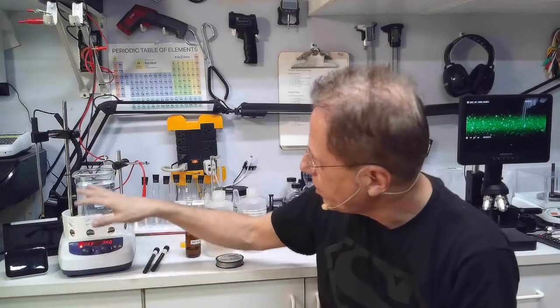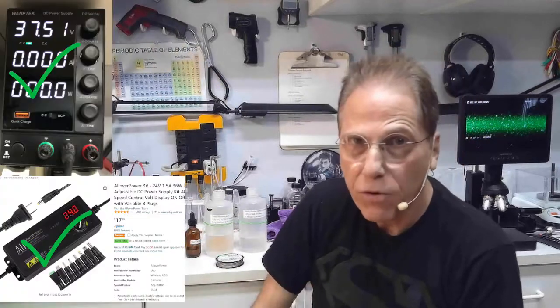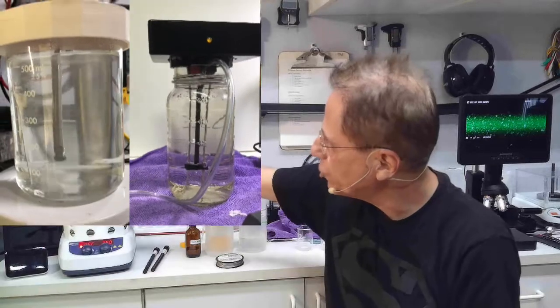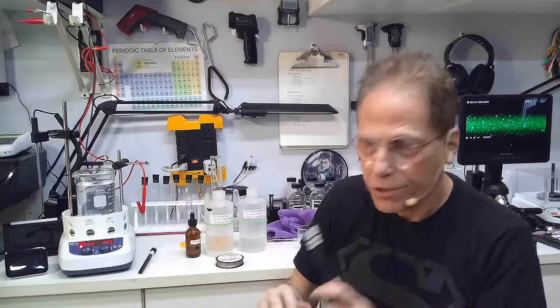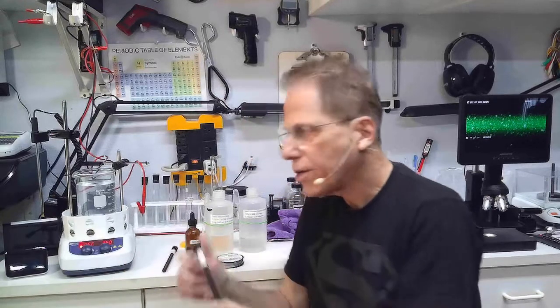You're going to need a power supply — I use 37.5 volts, but anything above 24 volts will work fine. You'll need a stirrer or some kind of agitation going on. And you'll need your rods — you only need one rod. I use a carbon rod.